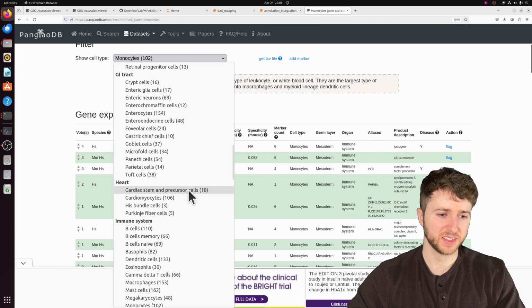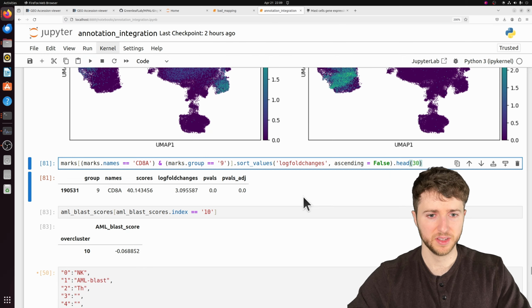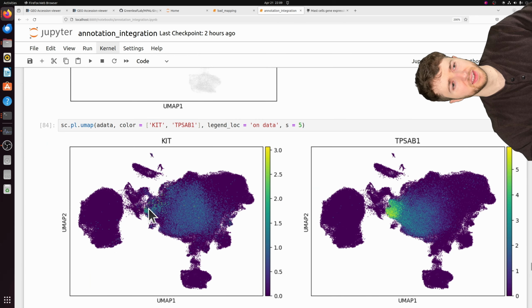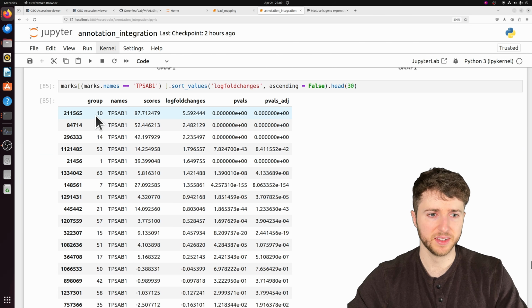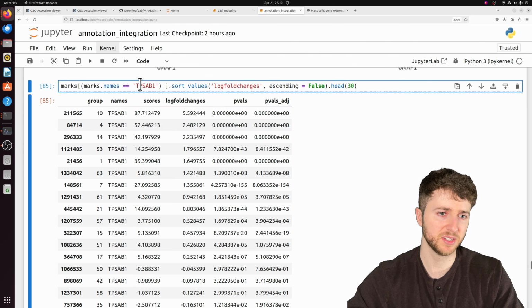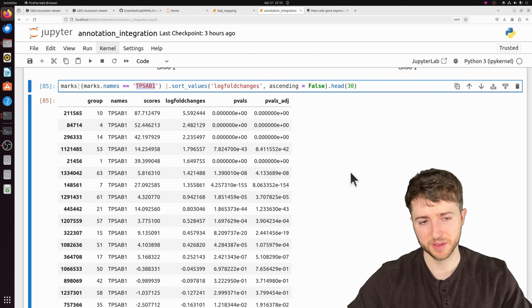What actually is expressed in mast cells? So we can go to a mast cell. Let's actually see these top 2 mast genes. And we see some stick out here with KIT. And this one, yes, very strong hit for this mast gene. And if we look at the expression, it is by far the cluster with the strongest expression of this mast gene. So yeah, it looks like a mast cell, but still it doesn't make sense.